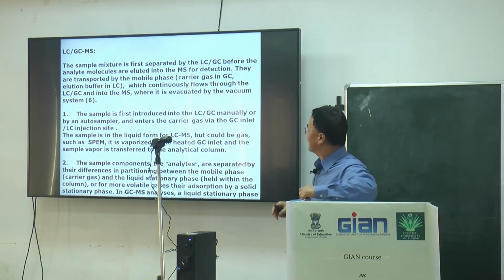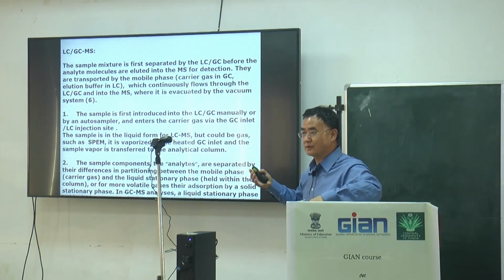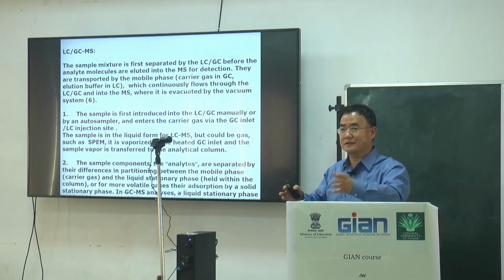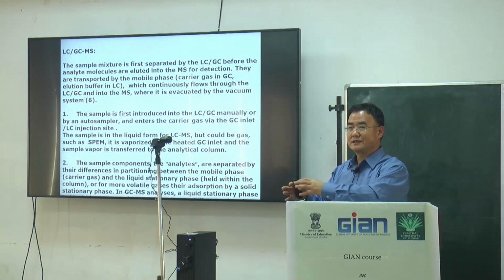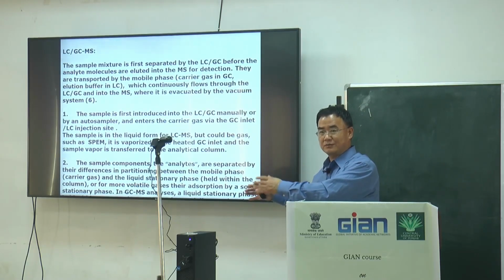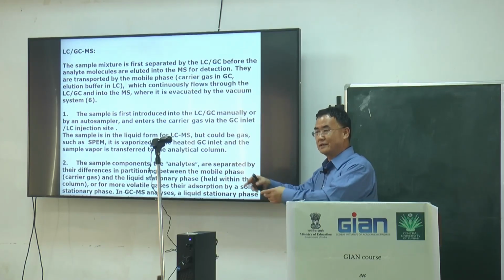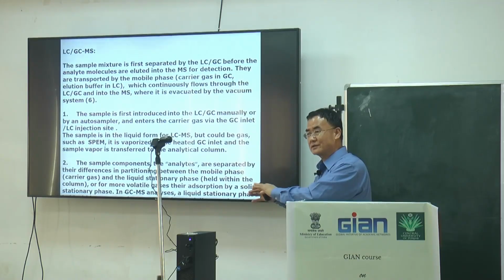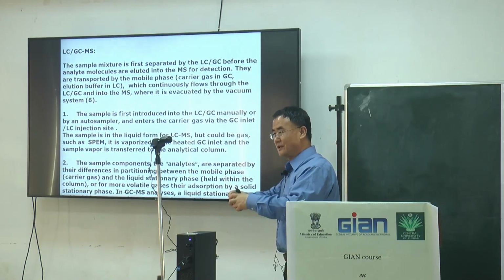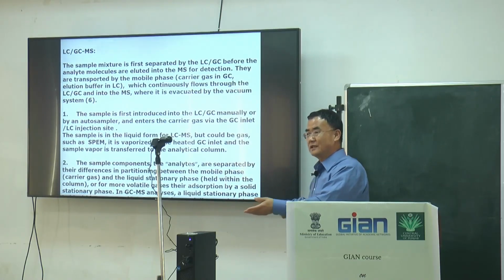But for LCMS, the concern is better separation, because the separation is always limited. That's why some people solve the problem from the mass spectral part, using an ion trap to enhance ion separation after ionization, using chemical ionization. When we extract lipids, we will show the different chemical ionization.